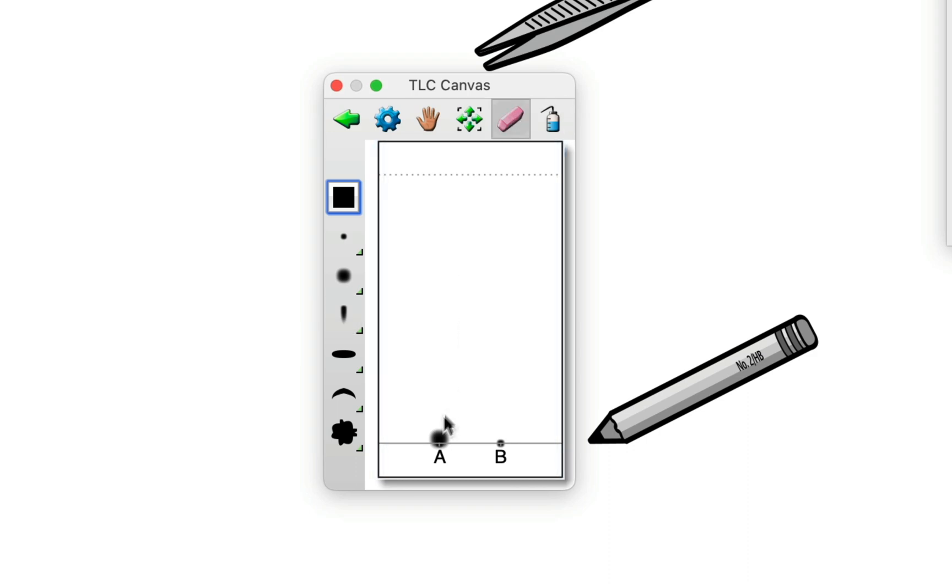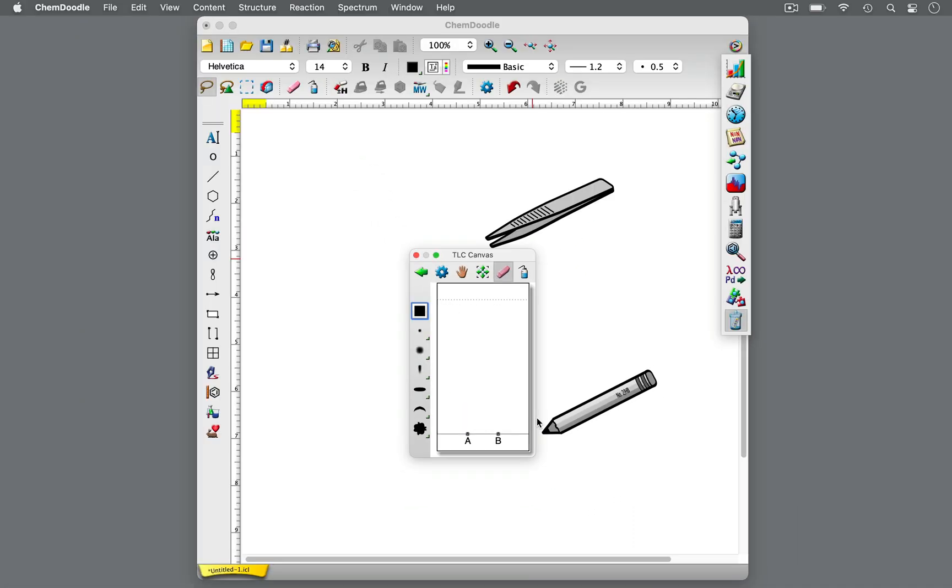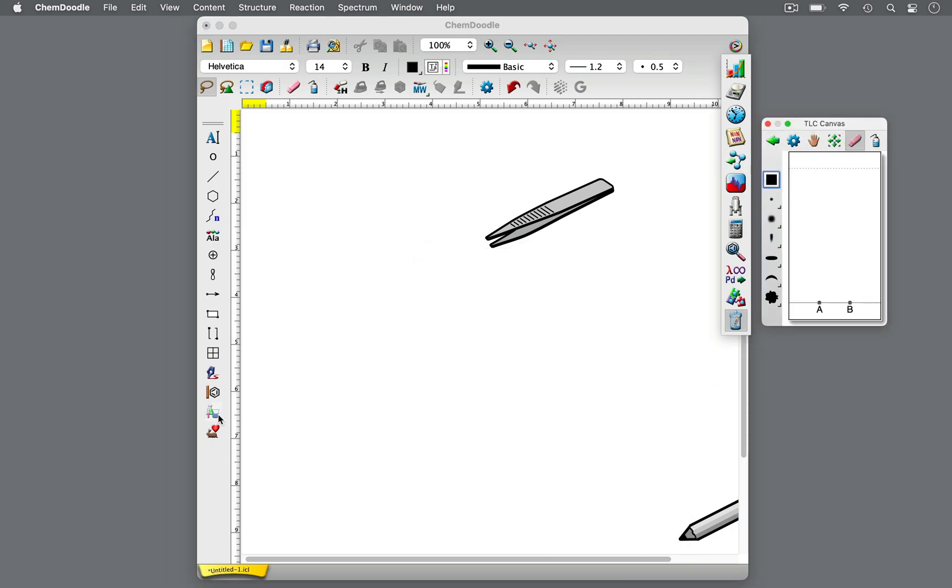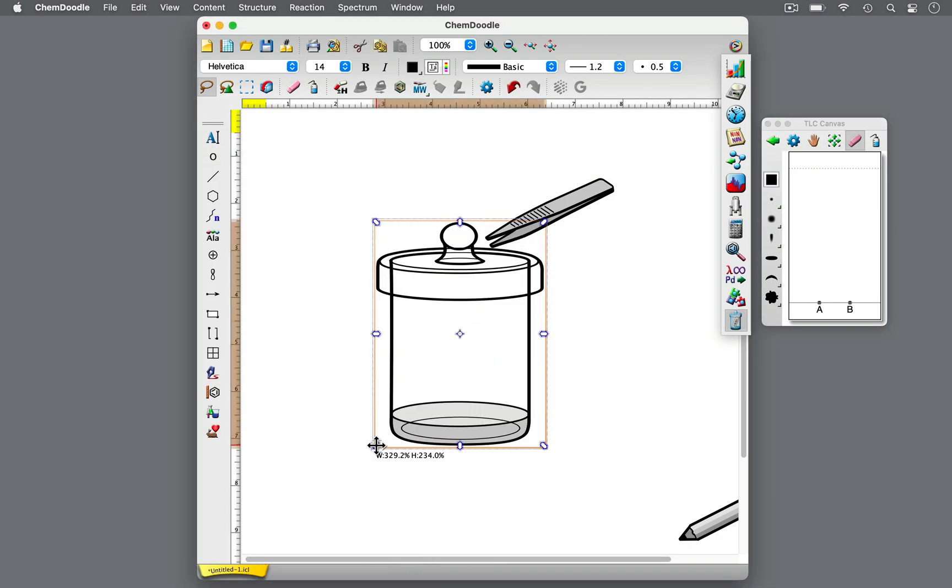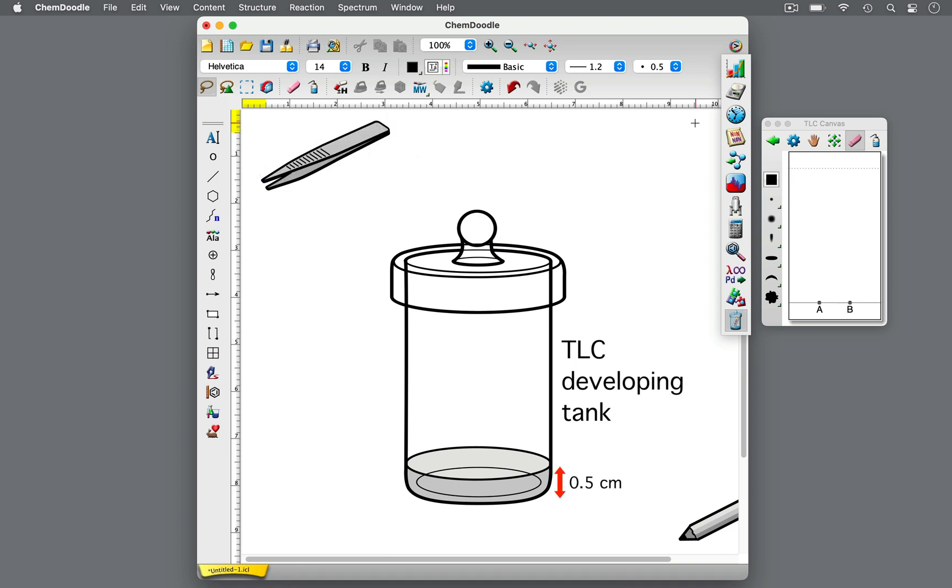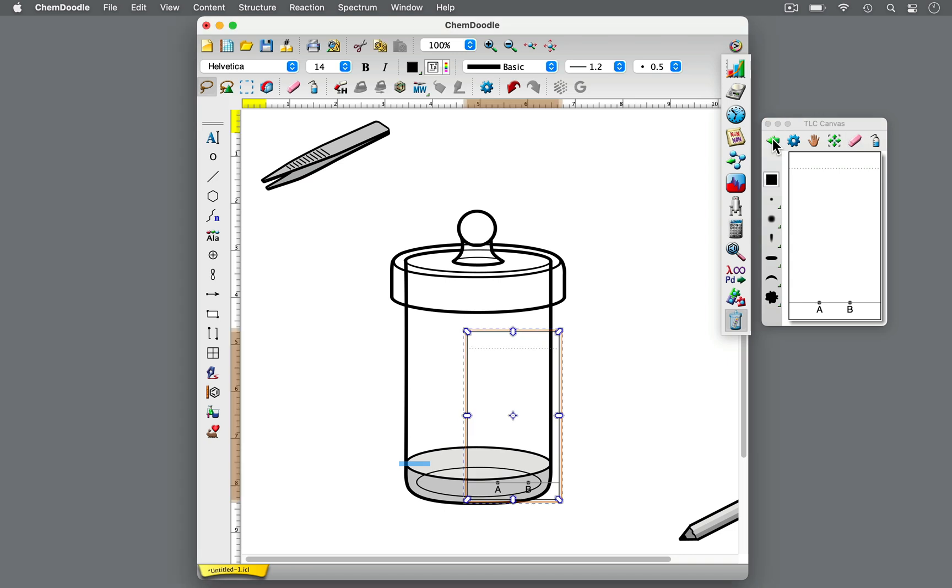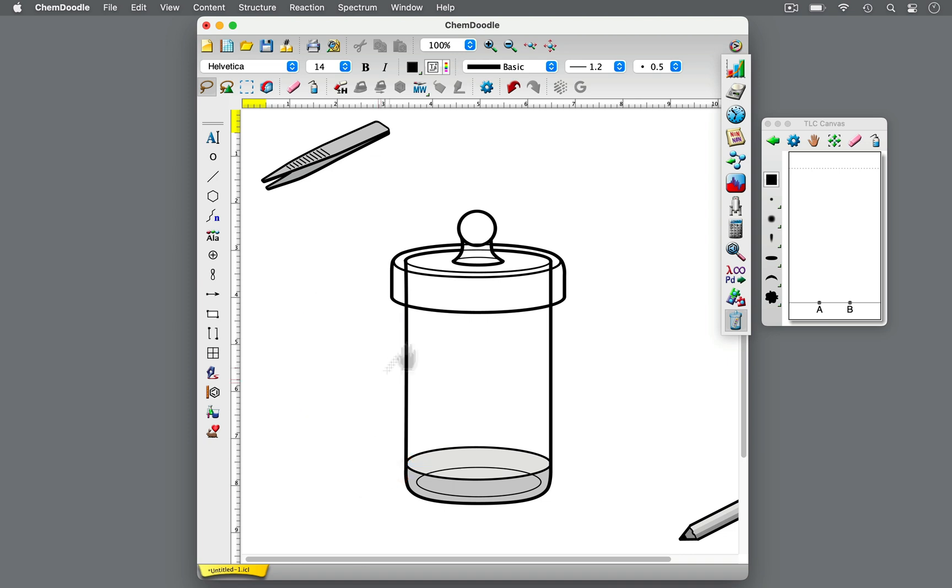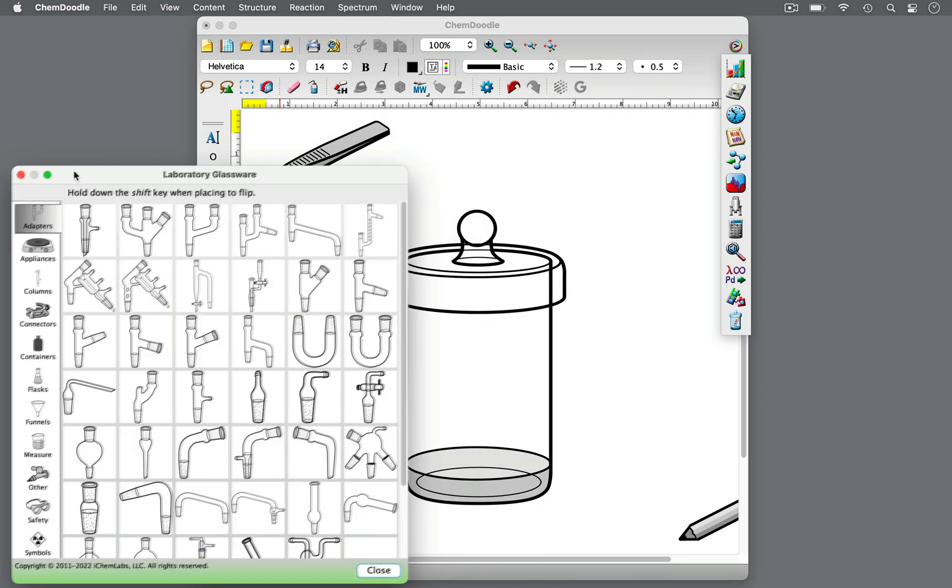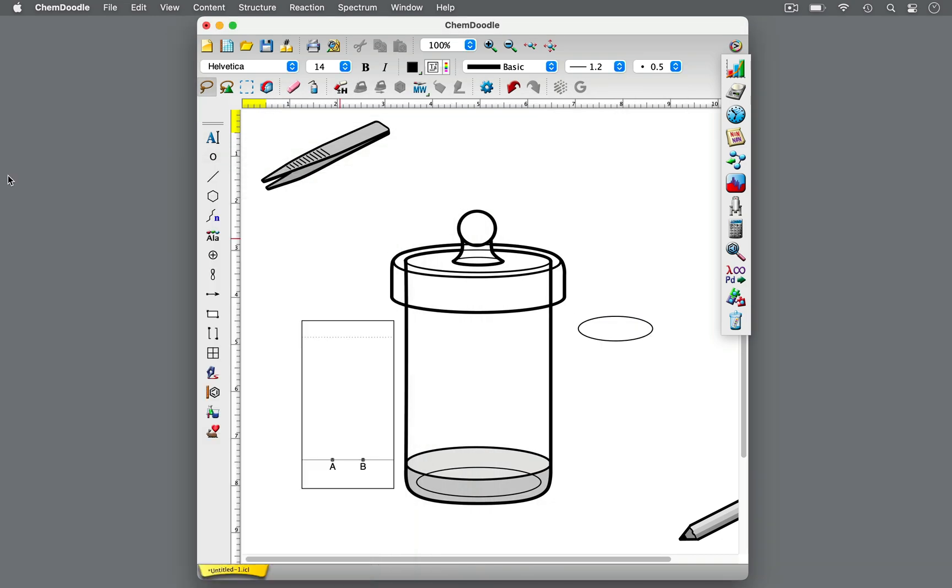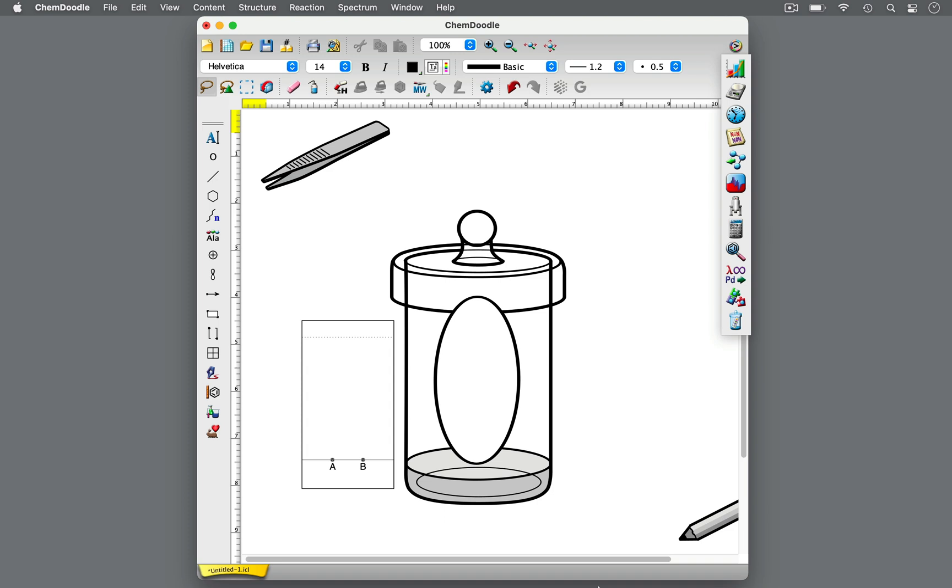With the samples spotted on the TLC plate, the TLC plate is ready to develop. First, set up a TLC developing tank filled with a small volume of solvent, about half a centimeter high, just enough to cover the bottom. The solvent level should not be higher than the horizontal starting line on the TLC plate, or the samples will wash away. The solvent is the mobile phase and varies based on the experiment. A piece of filter paper can be placed in the TLC chamber too. It absorbs some of the solvent and lines the wall of the developing chamber, saturating the environment with the solvent system to minimize evaporation and improve separation.